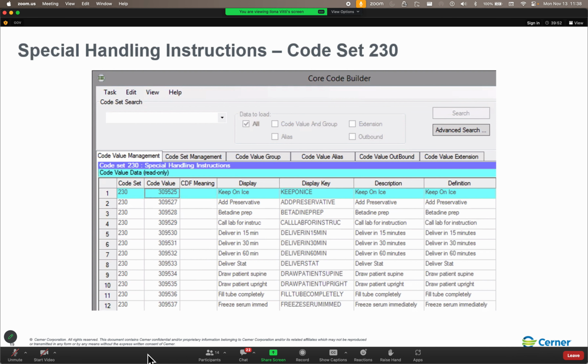However, I really recommend that they not be built in Core Code Builder. I recommend that they actually be built in the sources tool in McDB Tools. And I know you're wondering why. Why should micro be the gatekeeper for any new specimen types? Well, the folks that I had in class last week can totally answer that question, but I'm not going to pick on them. Instead, for the rest of you, micro has some additional build that needs to be done for these specimen types.